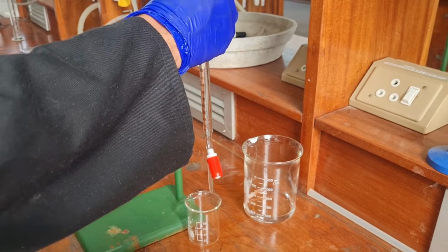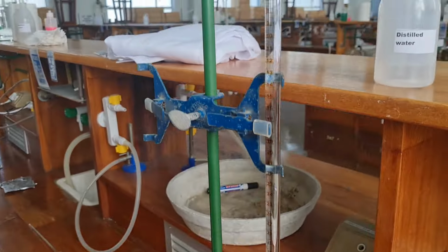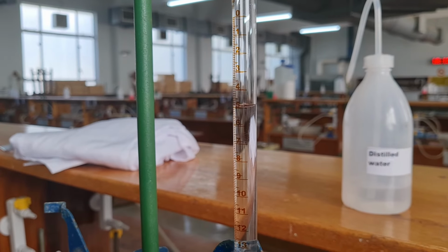Add 25 cubic centimeters of unknown solvent from the burette into each of the 3 clean, dry beakers used in the previous part of the experiment with the measuring cylinder.